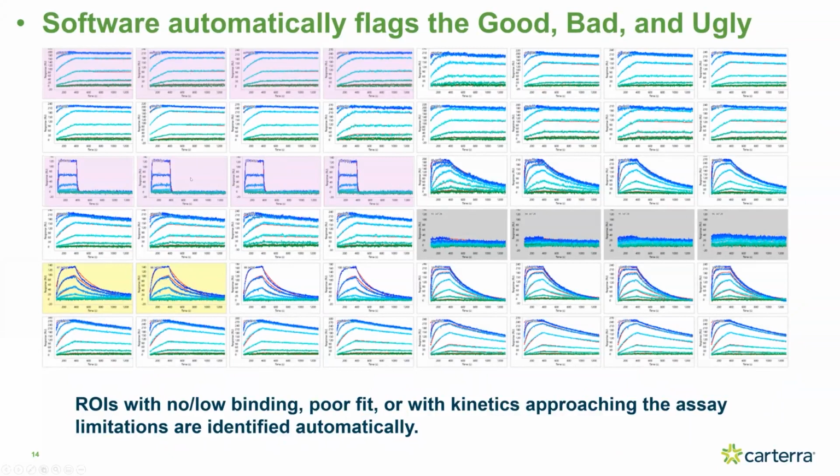And then the other case here is shown with an antibody where we didn't inject a high enough concentration of antigen to accurately determine the KD. So based on the model, it doesn't think we've injected a concentration of antigen over the KD. Therefore, we may not have enough association rate data to accurately predict it. So it will flag that for us as well. It will report a rate constant, but it flags it as something for us to be aware of.